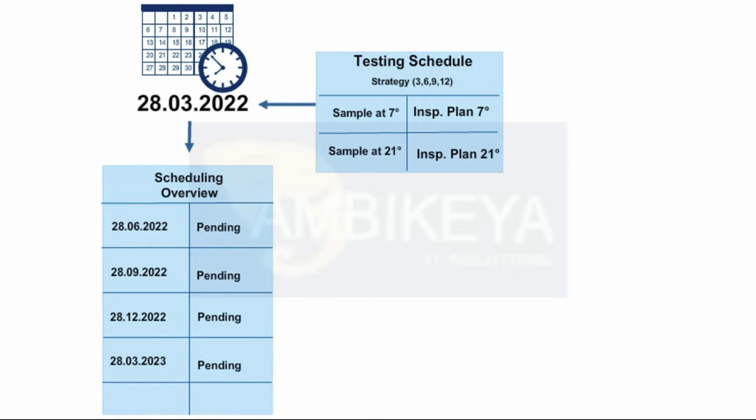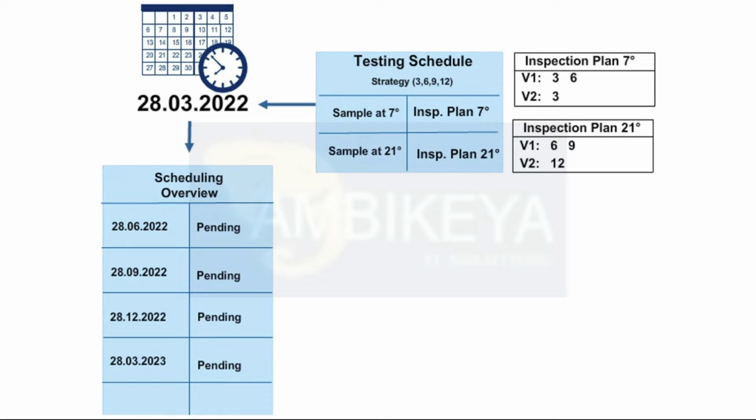Using the functions for deadline monitoring, the system creates an inspection lot for each storage condition or testing schedule item as soon as a test date becomes due.